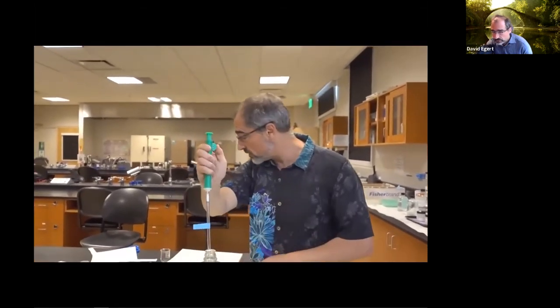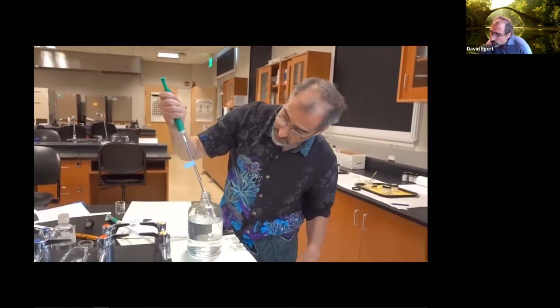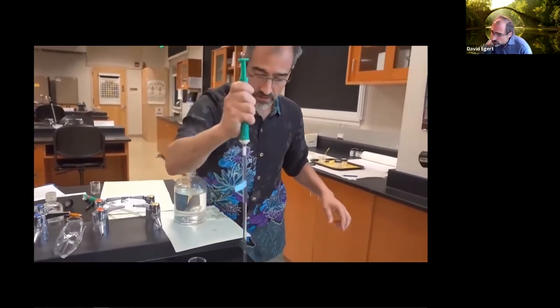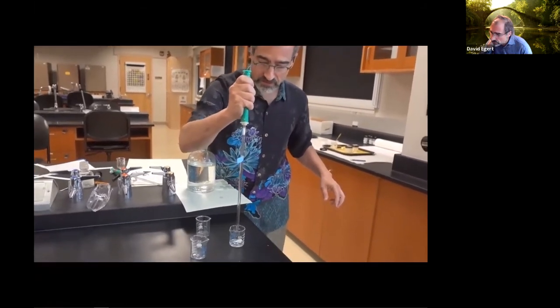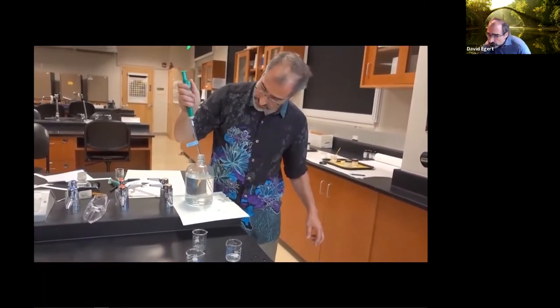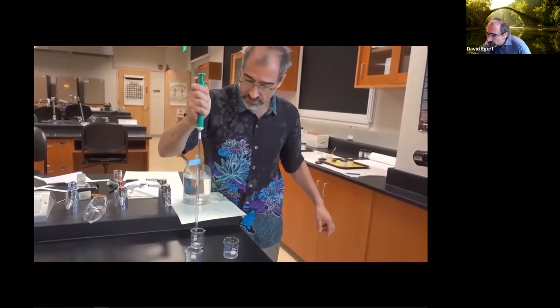So, because I need 5 mils inside each of these, I can just pull up to the 0. I'm going to quickly slap here. There's 5 mils there. Suck up again, up to the 0. 5 mils there.